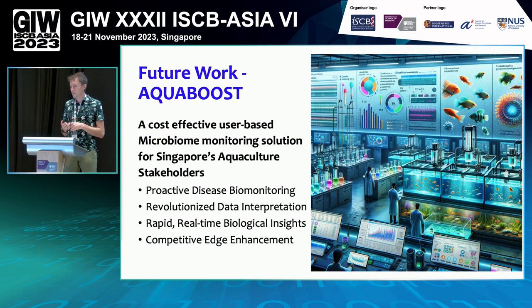And so moving forward, this was only a 6-month project, and we want to move it to a more complete piece of work. So for that, we've applied for additional funding for this AquaBoost project, where we'll be trying to expand our knowledge and increase the understanding we have of these aquaculture microbiomes, with the goal of generating a product that is relatively simple to use, rapid and real time. And of course, this also could include understanding viruses, but as some of you may be aware, it's much more difficult to work with viruses than with bacteria and fungus, at least for metagenomics. And with that, I'm done.